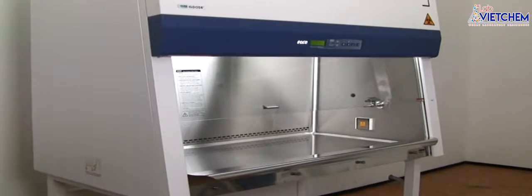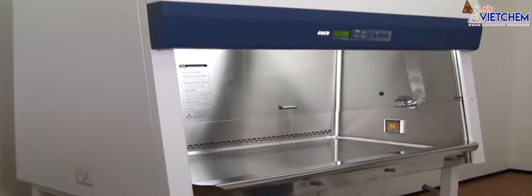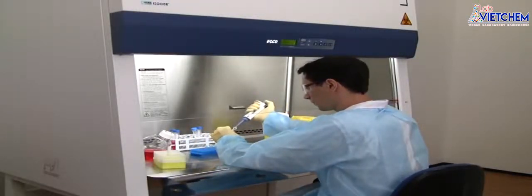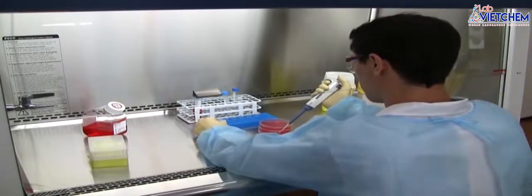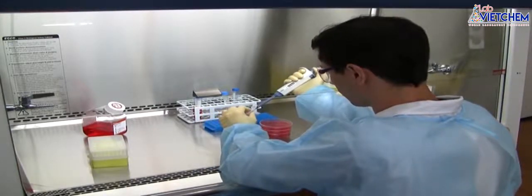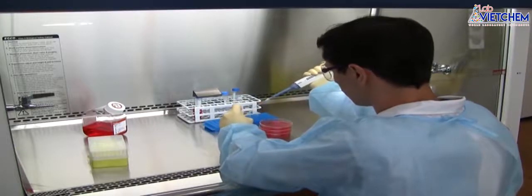A biological safety cabinet is an enclosed, ventilated workspace for safely working with materials contaminated with or potentially contaminated with pathogens in the laboratory. The primary purpose of a BSC is to serve as the primary means to protect the laboratory worker and the surrounding environment from pathogens. All exhaust air is HEPA filtered as it exits the biosafety cabinet, removing harmful bacteria and viruses.